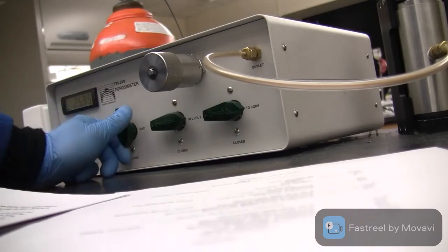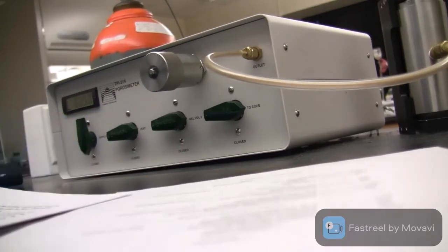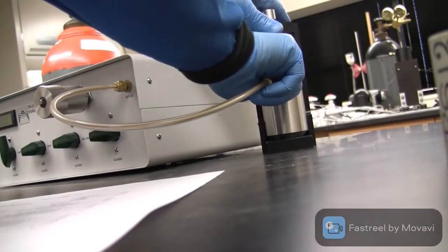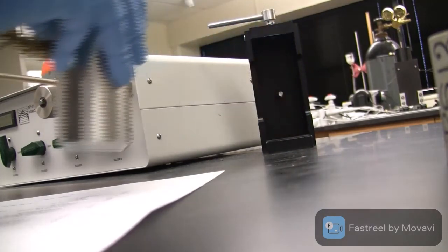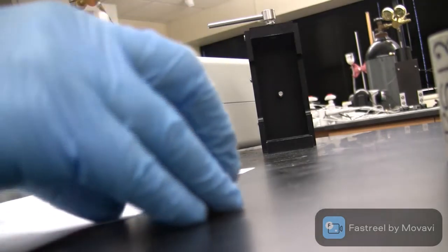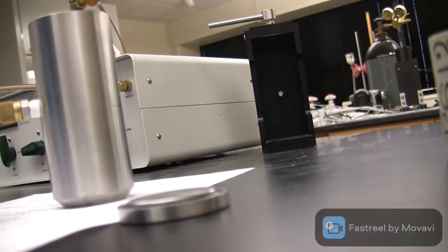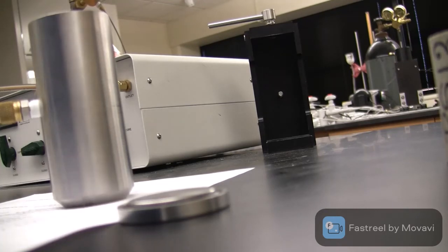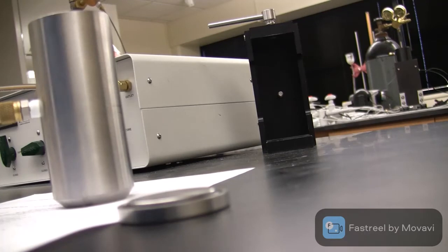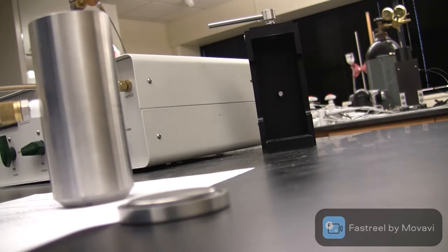First, let's open our vent valve to reduce the pressure. Then we open here. One more important note, we usually need to take the weight of our core, but we can do that with any balance, so that you have the weight and the final equation.